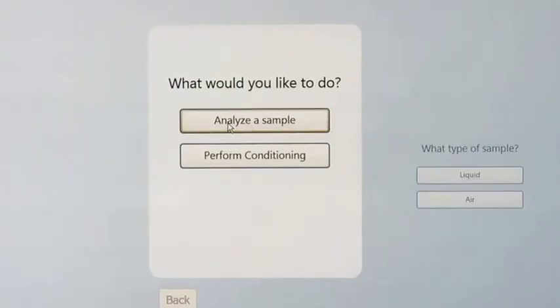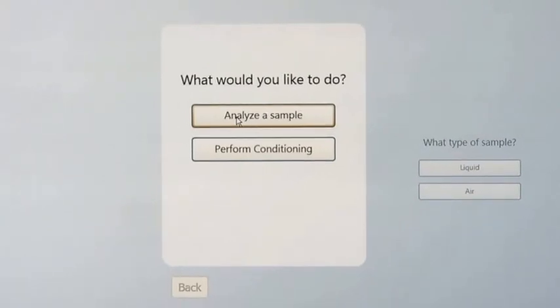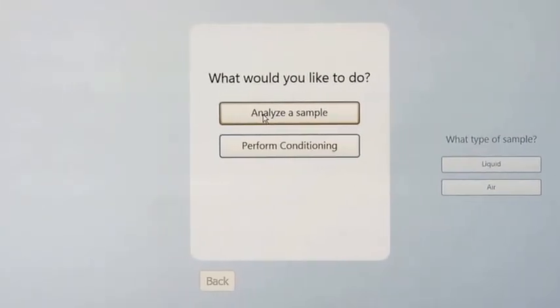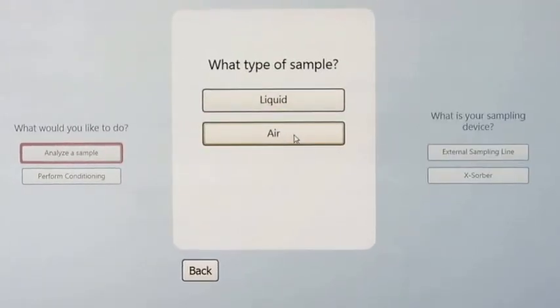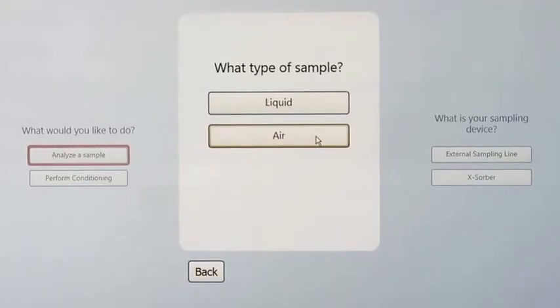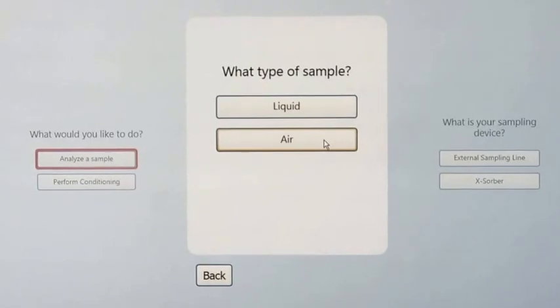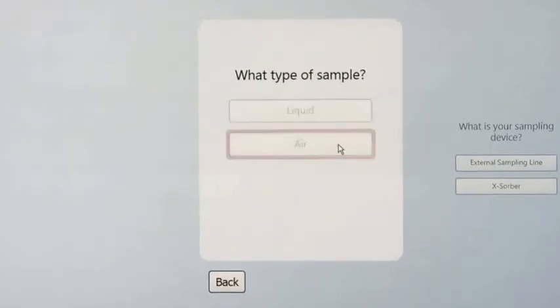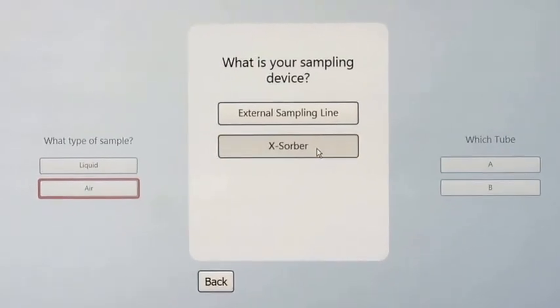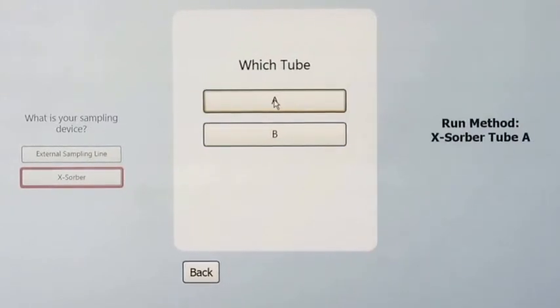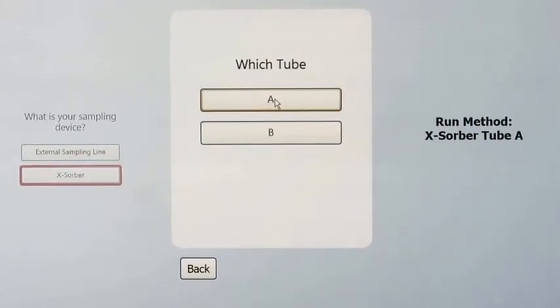The selector asks me a series of questions. It's asking if I'd like to analyze the sample or perform conditioning, and we do want to analyze the sample. Next it asks what type of sample, and today I use the Xorber, so I select air. Then it asks what was my sampling device, and we use the Xorber, and I select tube A because that's the tube we collected the sample on.